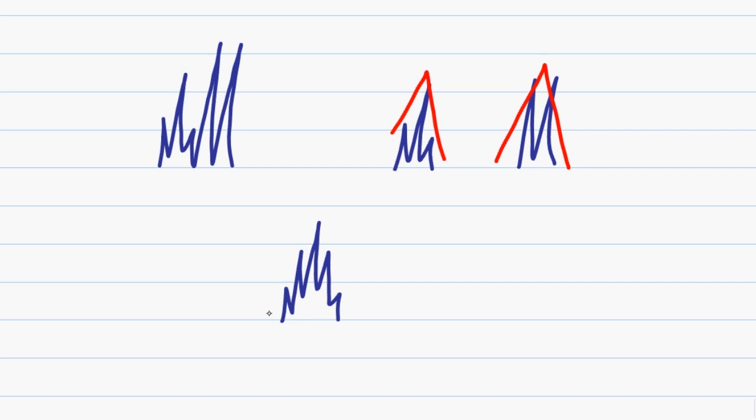And the same thing applies for this complicated quintet. However, going back to my original peak, if I try to do the hat trick, notice that I have this peak right here that does not fit and so I know that it's incorrect. However, notice I can draw two separate hats or two separate triangles and this shows me that these are actually two peaks that are overlapping on the graph.